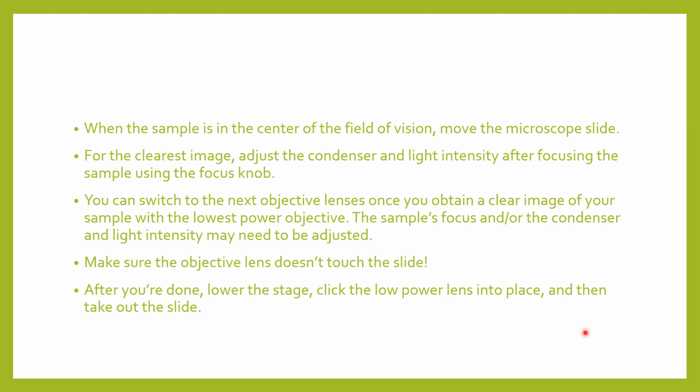And once everything is done and you have visualized everything, you have to lower the stage again. It's not that you should grab the slide, because there will be chances that the slide might touch the objective and crack, and that's the reason you have to lower the stage. Then click the low power lens into place again, and then take out the slide. Okay, this is what has to be followed.